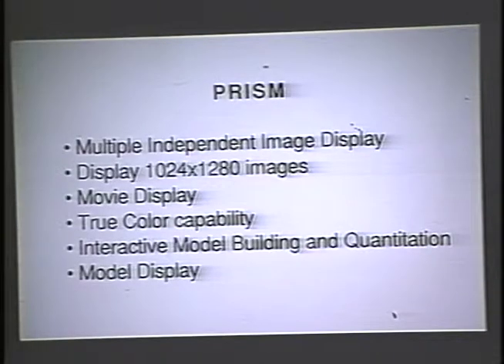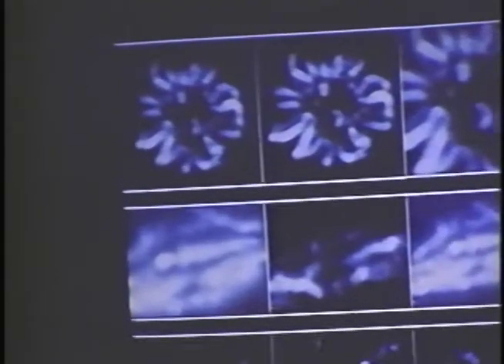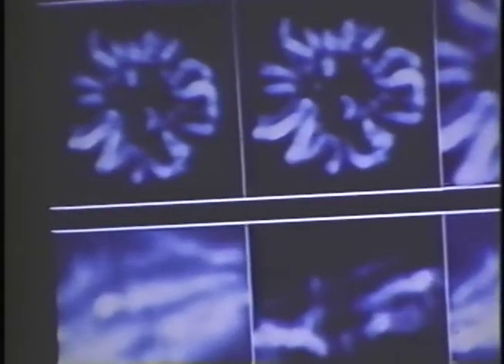For example, 2 windows on the screen may correspond to the left and right views of the stereo pair of your specimen. Okay? It could also be, at the same time, you could have a stereo pair, and in another 2 windows on the screen, you could have, so here's a screen showing multiple views. Okay? And each of these windows are fully independent objects, and you can have whatever you want in there.